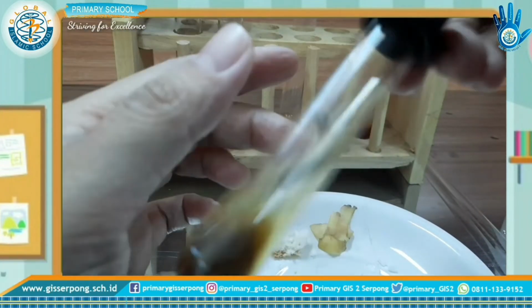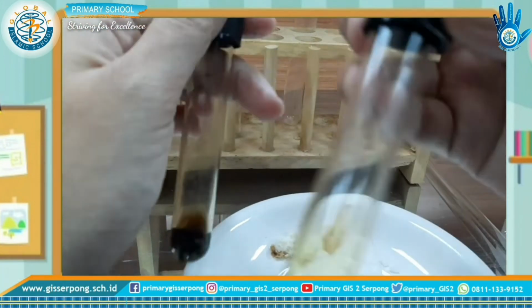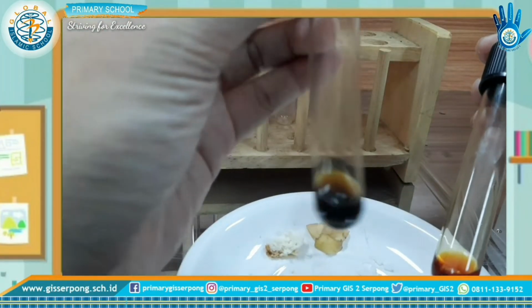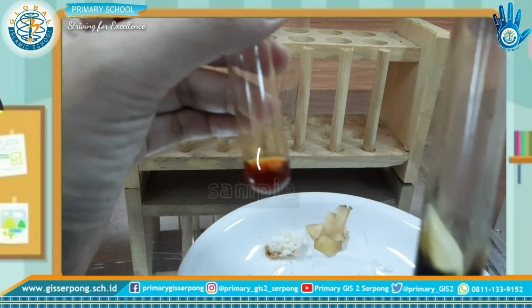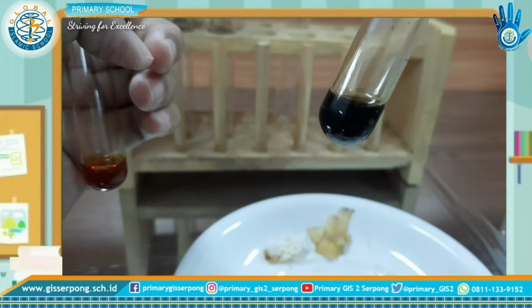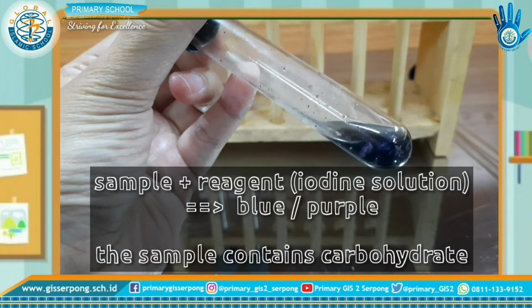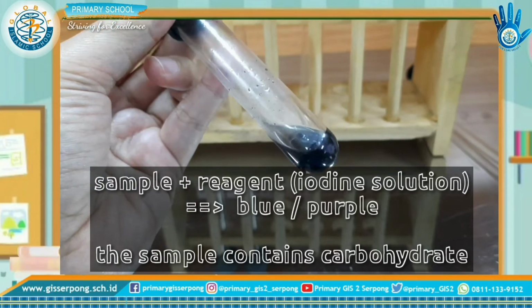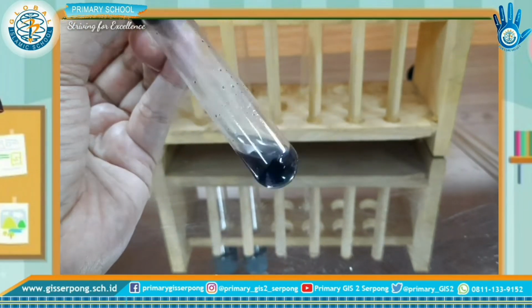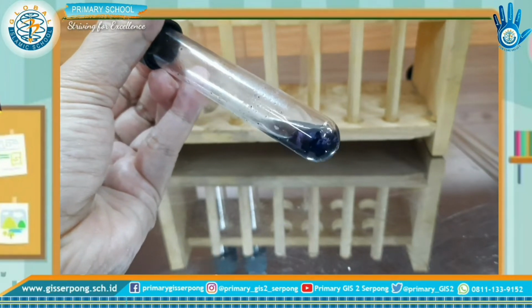Okay, let's compare the reagent with sample and without sample. This is the control. You can see the color is brown, and for the sample, the reagent with sample is dark purple or blue. Observe the change in color. If there is appearance of blue or purple, dark purple, then the presence of carbohydrate is confirmed, like this. It's positive carbohydrate or amylum or starch.